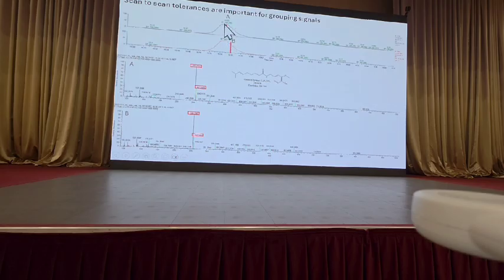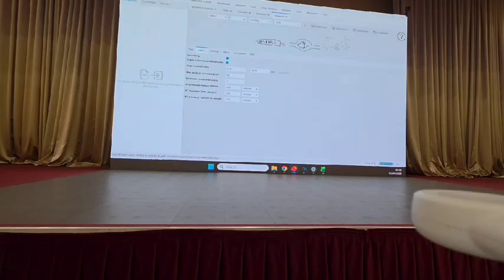So if we're looking at the C12 and the C13 peaks, how much does the retention time shift of the two isotopes within the same sample? You can see right here, the retention time shouldn't shift at all if it's the isotopic peak. So it should be actually a quite conservative, strict value, and the default setting of 0.04 is quite fine.